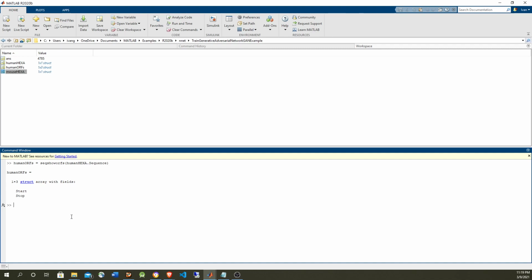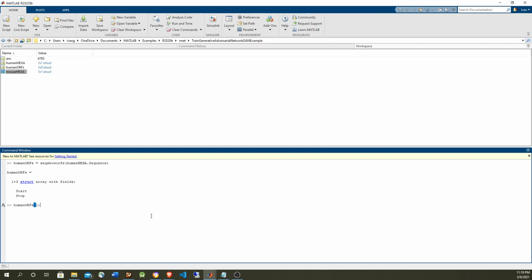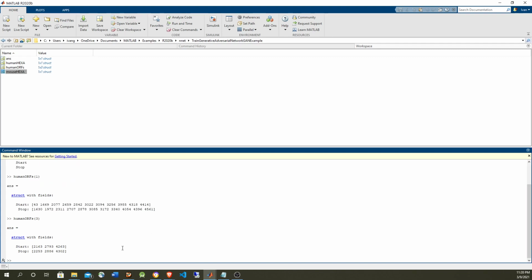So let's take a look at how they look. Let's take the first frame, and we can see the initial one and the ending as we saw. The first one is the longest one. It has about maybe 1600 characters, but the others maybe have 10 or something like that. They are pretty small. Start, end, start, end, start, end, start, end. And the final frame had only 3, and as you can see, they are short as well.